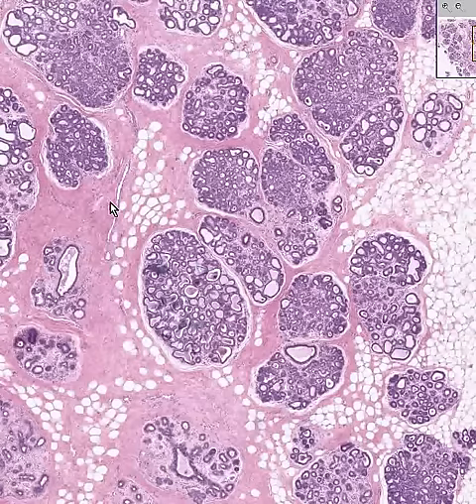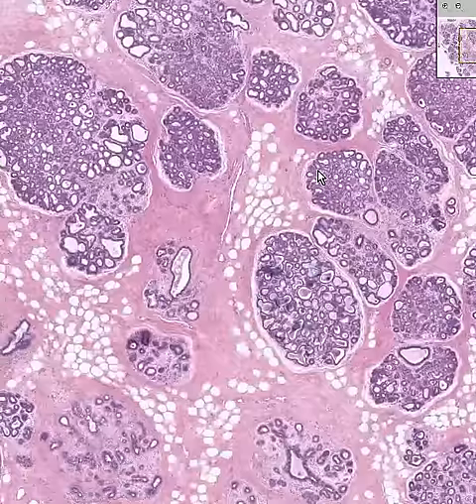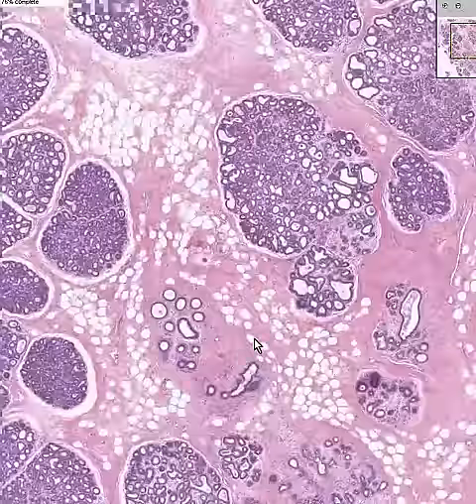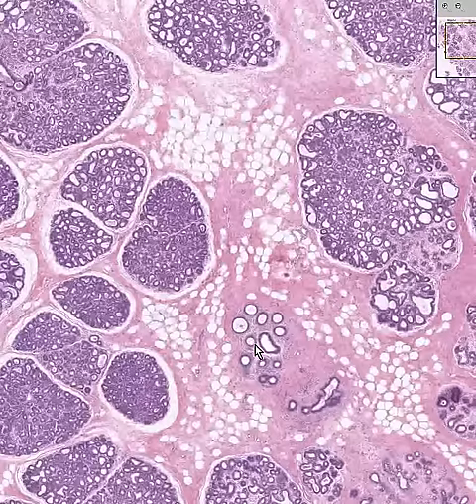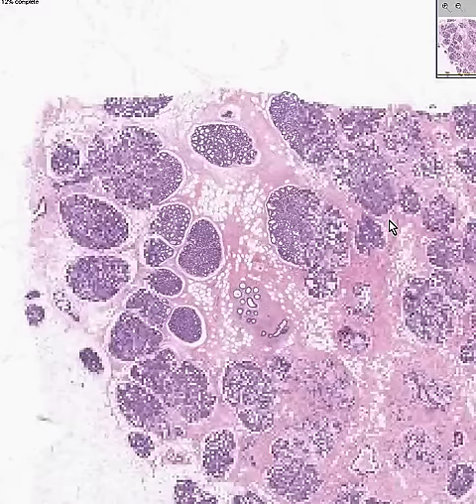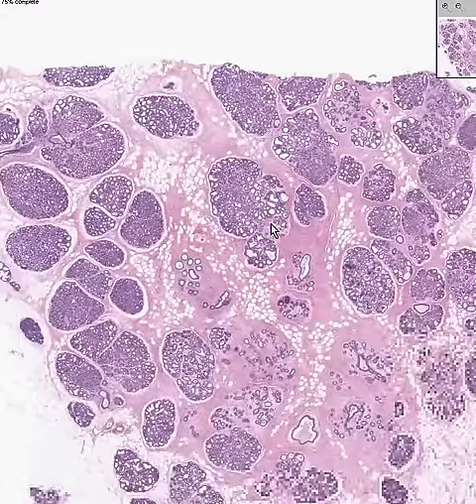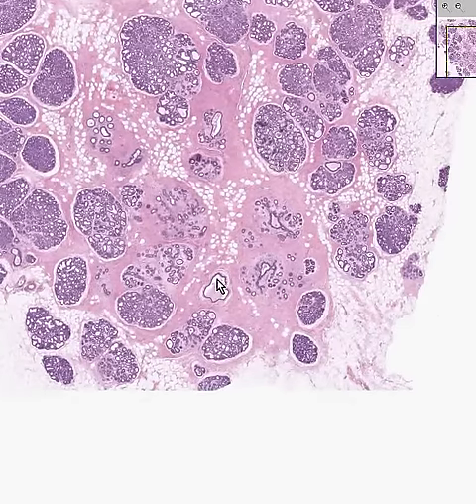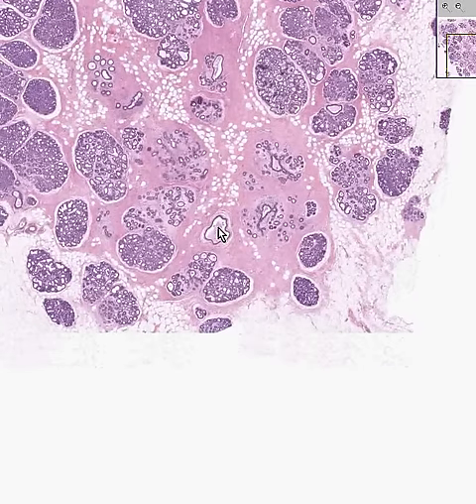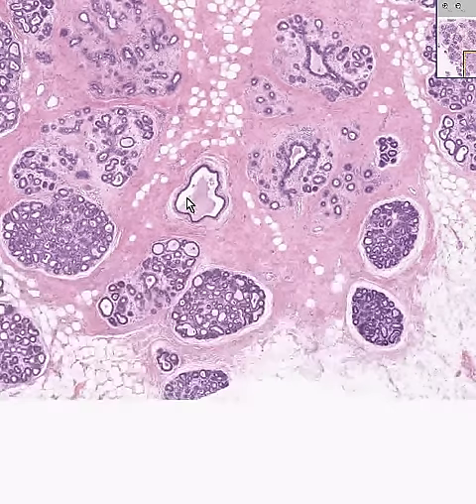Let's find a large duct perhaps. Probably here are a few larger ones, but let's see if we could find something larger than that. I think you could say this is a pretty large size duct. And look how it is filled with milk as well.